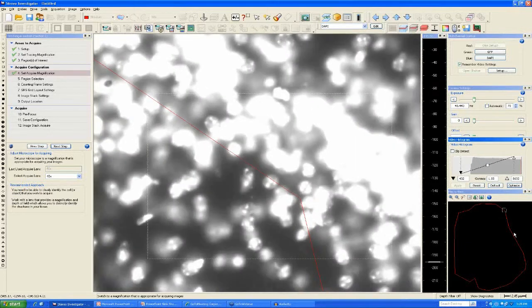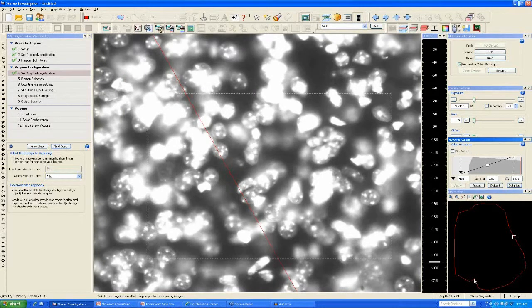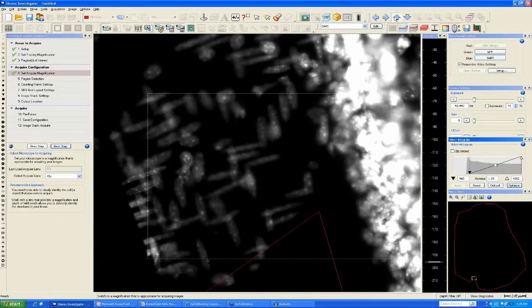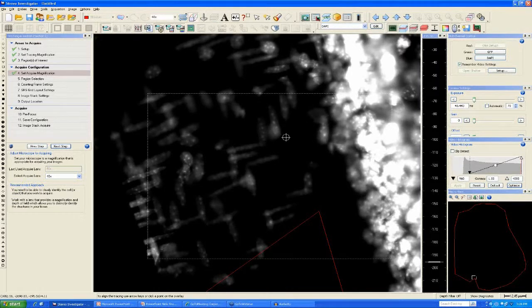Clicking anywhere in the macro view with the left button will move the stage to that location. This can be useful if tracing edges need to be aligned with anatomy. To shift the region of interest, right-click to end joystick mode, select the Align Tracing button, click anywhere in the contour, and then click the location on the tissue where that position of the contour should be.